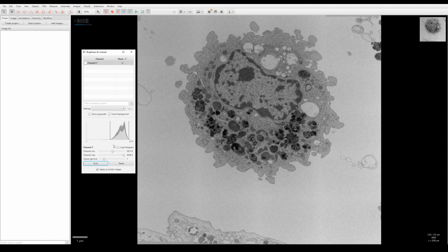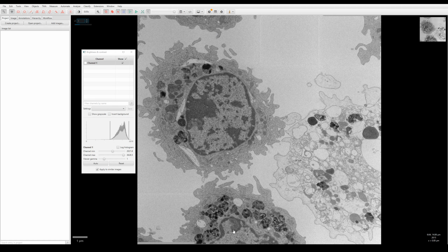So the other image didn't have a Z control because it was only one gigantic image. Here, you can see each one, roughly the size of one tile. It wasn't as many tiles as the other one, but we took these over multiple locations. If you notice things like this, these are typical artifacts because the software we used before we give you this file is trying to stitch the images together, and it has trouble stitching where there's sort of no features. So that's why you can sometimes see things like this.